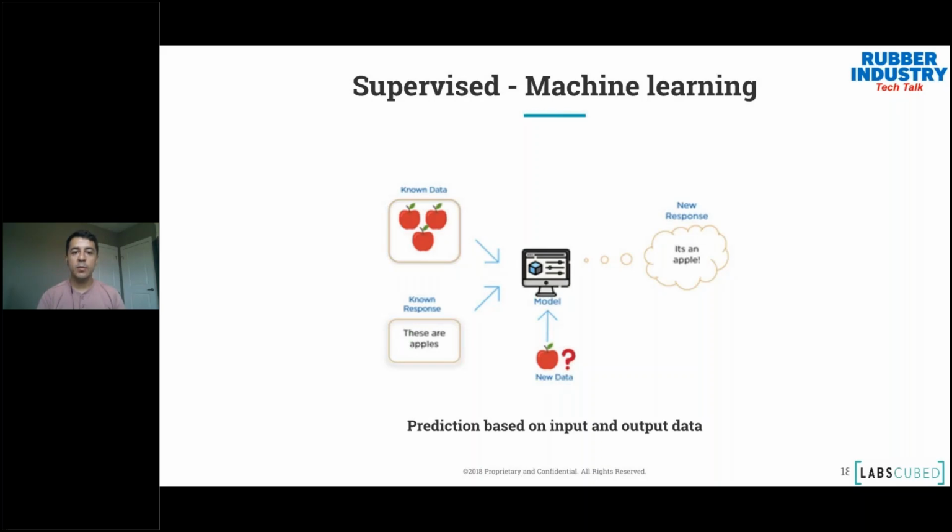As you can see, it's very important that known good data goes in. If we fed it pictures of oranges and told it those oranges are apples, it would predict incorrectly. So it's all about that good known data. And that's a big part of this: clean, good data is the most important thing. If you feed really bad data into any model, I don't care how great it is, it's still going to give you a bad prediction. So the data and what you're producing is really important. Hence, as you automate, you get better, more consistent data, and your model becomes much more powerful and much better at prediction.